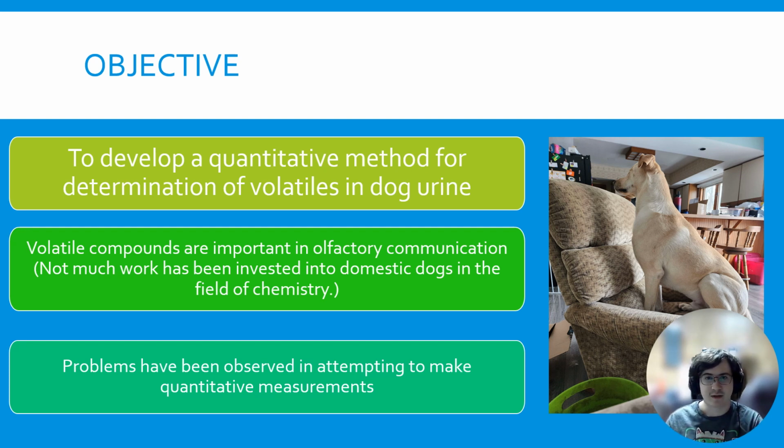The problem is there are some critics of solid phase microextraction. I am trying to determine whether or not the method is actually truly quantitative, and whether or not it could be applicable for our project. And if it is, how do we do it?